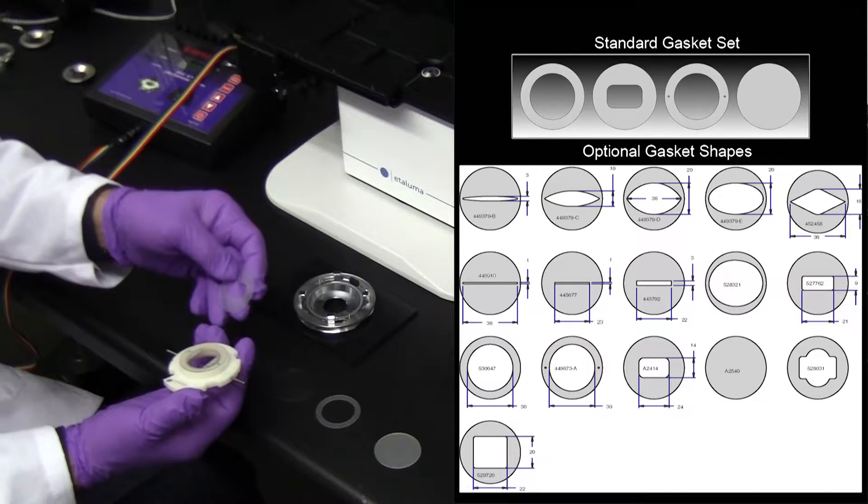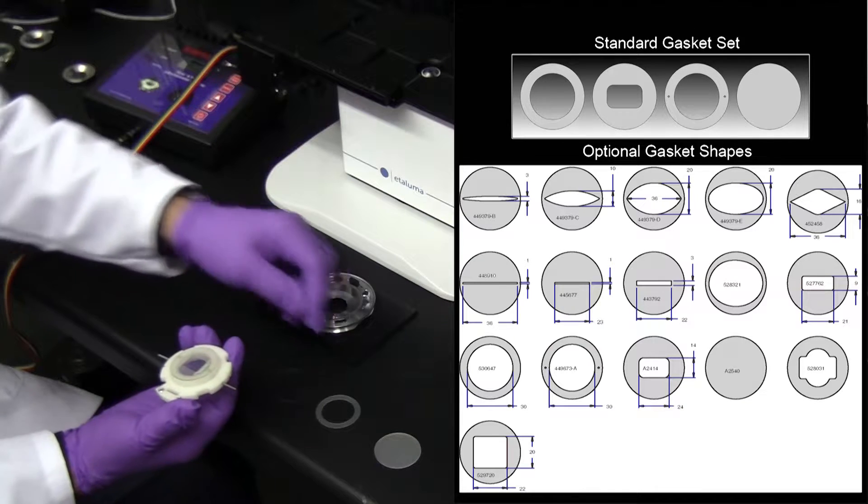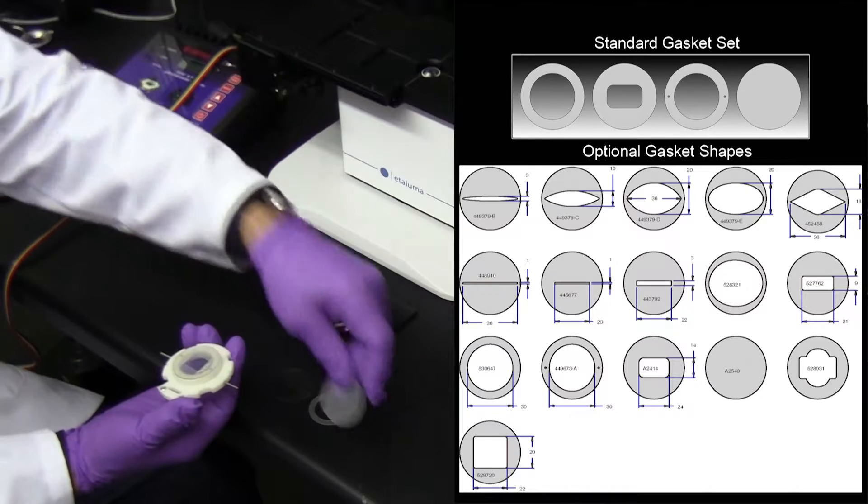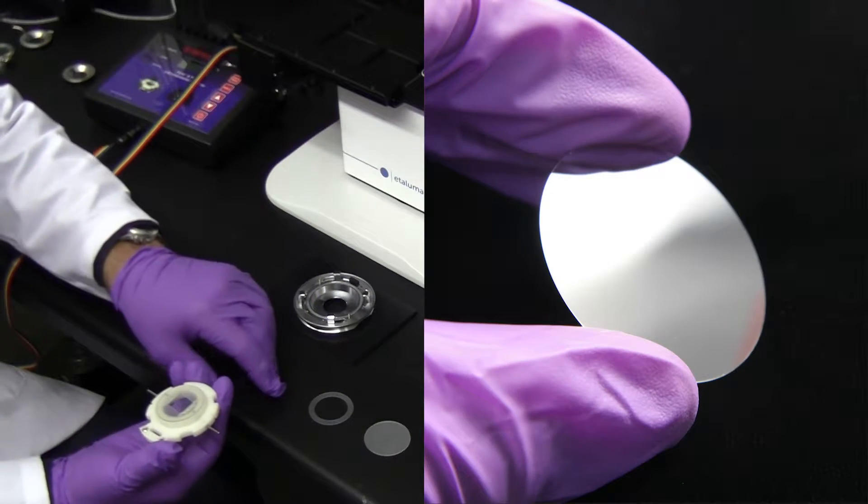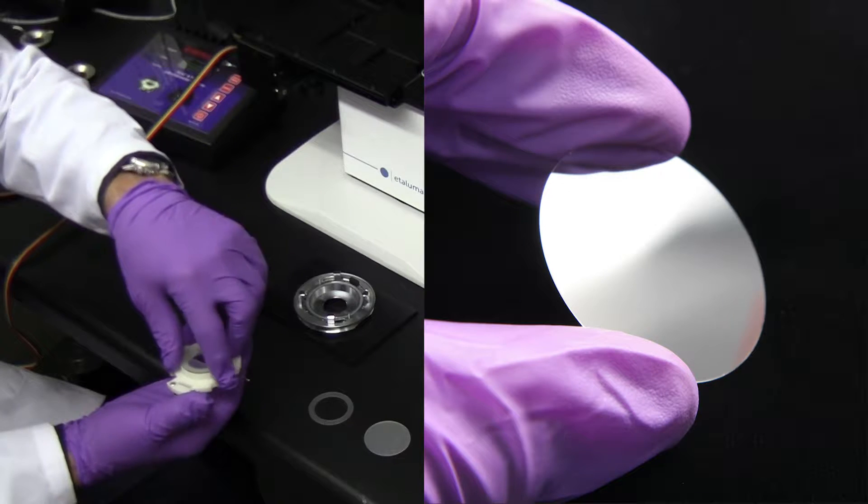It is held separate from cells on a coverslip by a single gasket. The thickness and internal shape of this gasket enable the user to select or define the flow characteristics they want, either by selecting from the variety of already available gaskets or making their own.